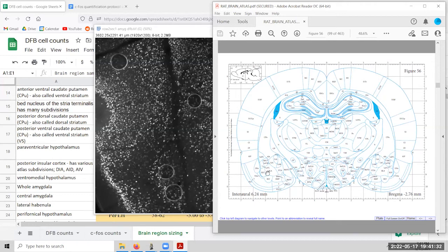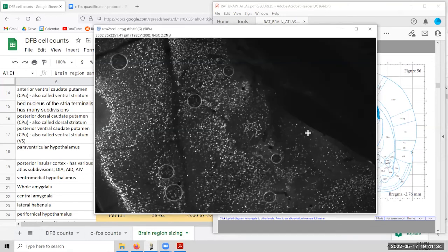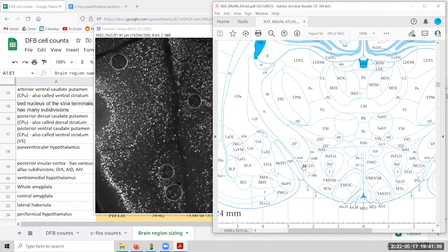So it first appears here is optic chiasm. And as we go more far back into the brain, it finally splits, and then it starts going up into the brain. And as we go deeper, it becomes much more wedge-shaped. In this case, page 56 might be actually a better match with what we're looking at here, because this is a much more steep wedge that we have going on. So we see that we have the amygdala, but basal lateral amygdala is this general triangle with a knob on the bottom here. We've got the central amygdala still having its same similar shape. We've got medial amygdala reaching down in and through here. So I'm going to try to draw these three things separately, and then I'll do one go around where it's all of them together. And we'll see if the counts all combine appropriately.